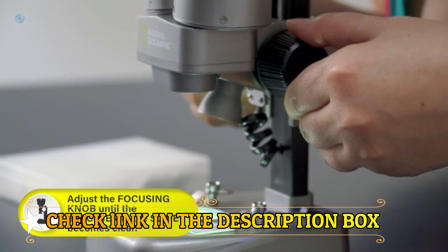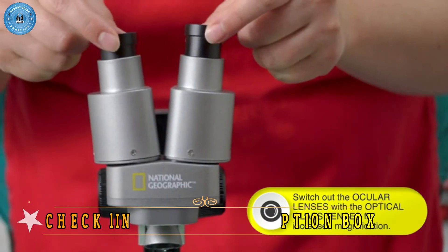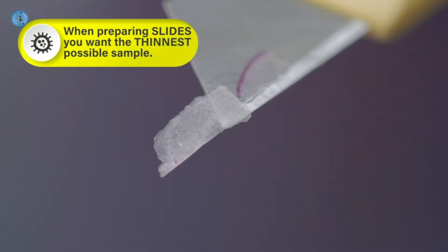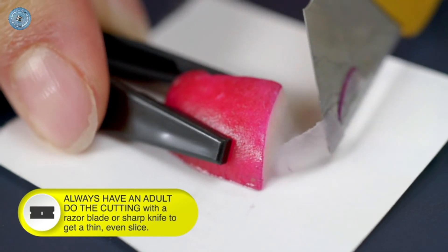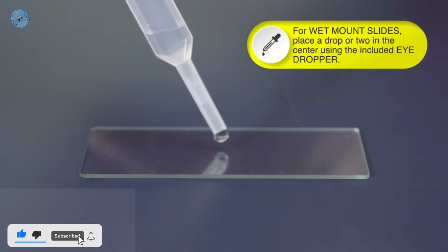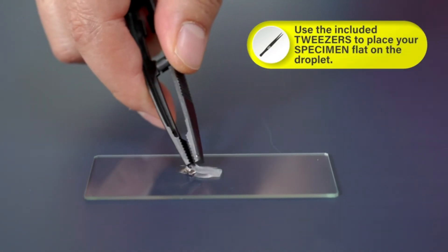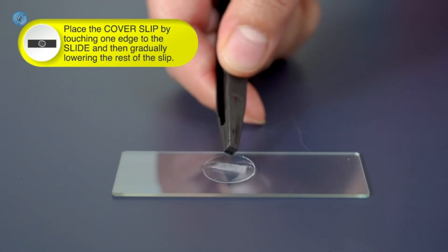Powerful learning tool: this microscope features two sets of optical glass lenses providing 20x and 50x magnification, and is easy to operate, making learning fun and accessible for young scientists. Kid science experiments have never been so fun. Brine shrimp experiment included — track the life cycle of brine shrimp with the complete included experiment, which includes a hatchery station, shrimp eggs, petri dish, and lab manual. Includes a detailed, full-color STEM learning guide. National Geographic is proud to make the highest quality hands-on science toys, and all products are backed by exceptional service.